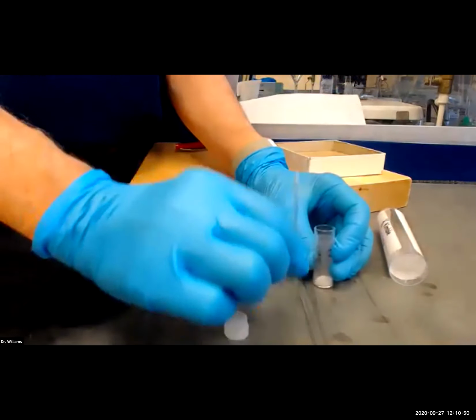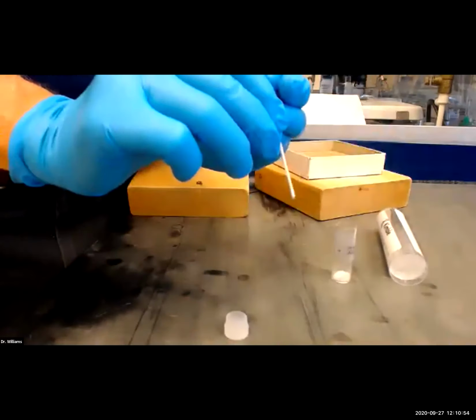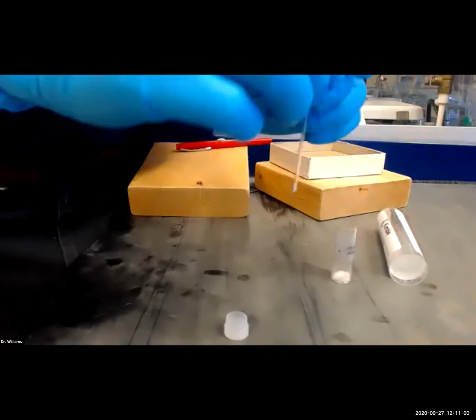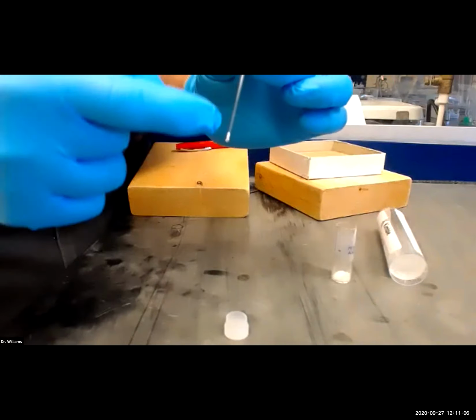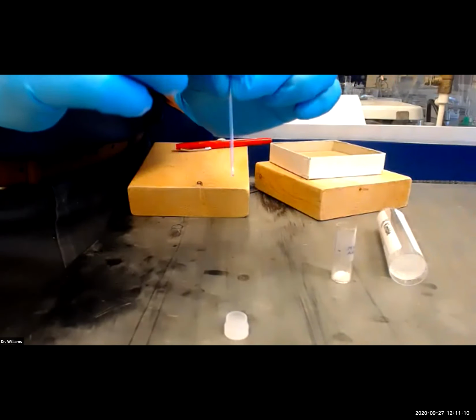You can tap it on the bench top. You can see this. That's about 3 millimeters. That's going to be fine. The way the instrument works is it actually passes a beam of radiation through the sample. And of course, it's going to be opaque. As soon as it becomes transparent, radiation gets through and it creates a signal. So it's kind of cool. All right, that looks good.